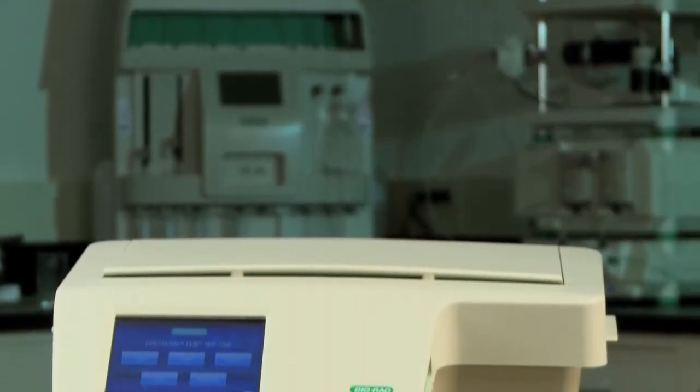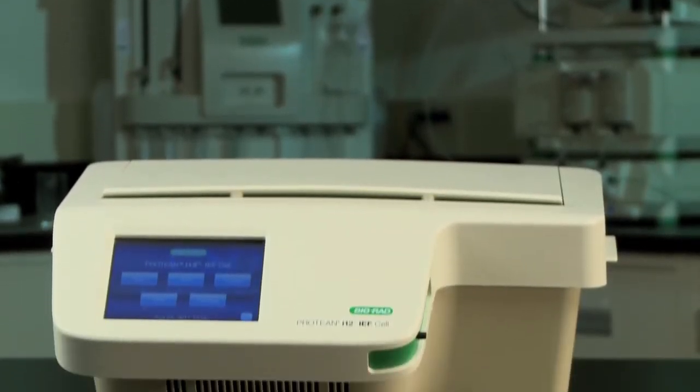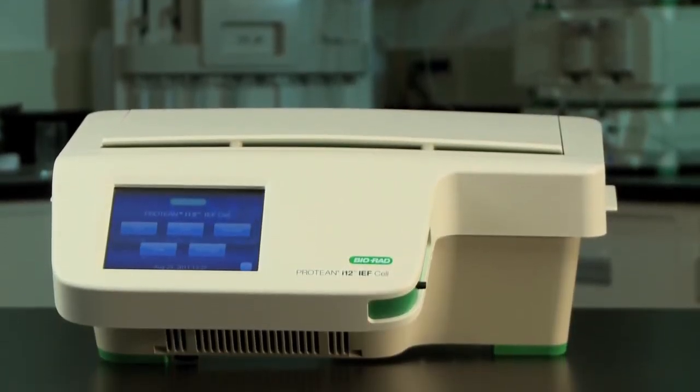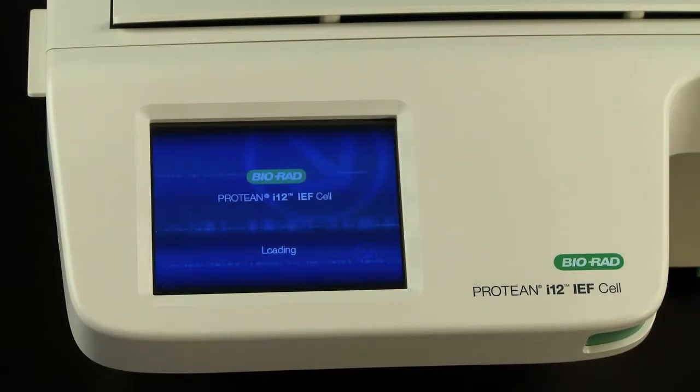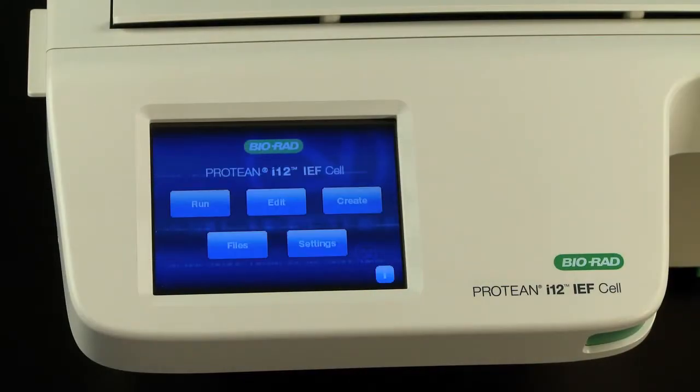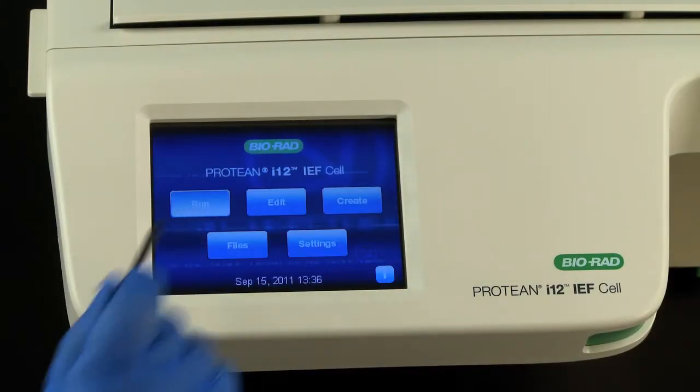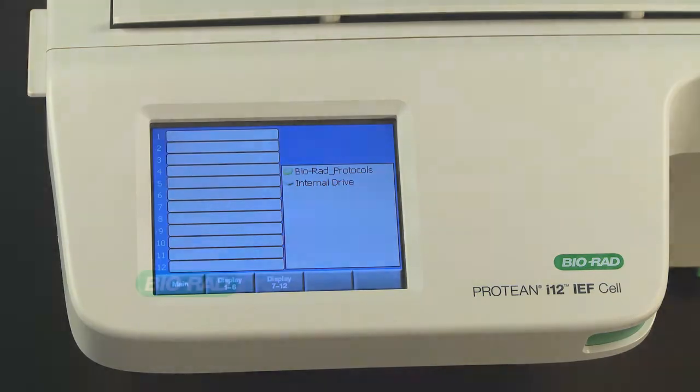The PROTEAN i12 system is operated by an onboard touchscreen user interface that makes starting a run and creating new protocols simple. This video will show you how to get started.